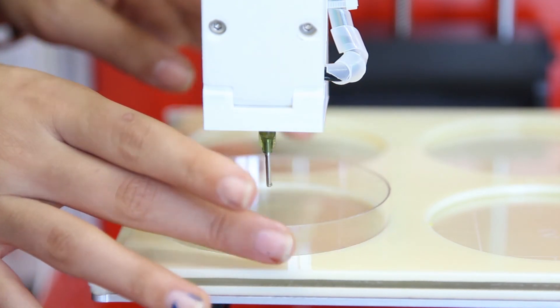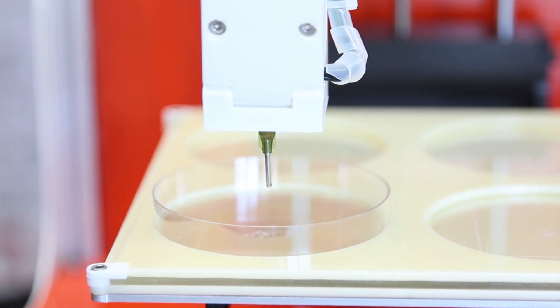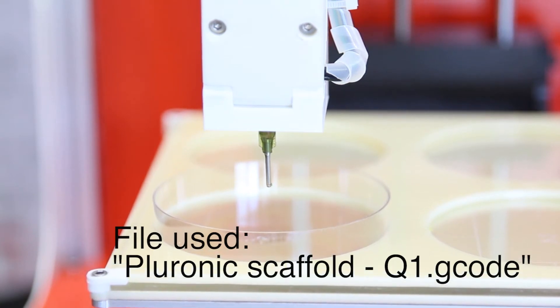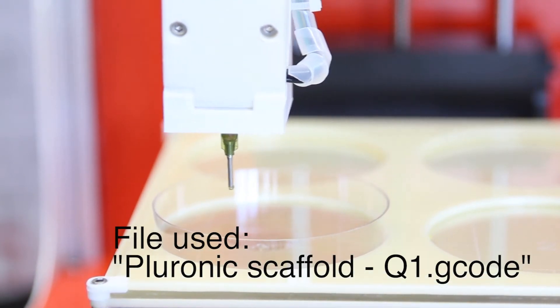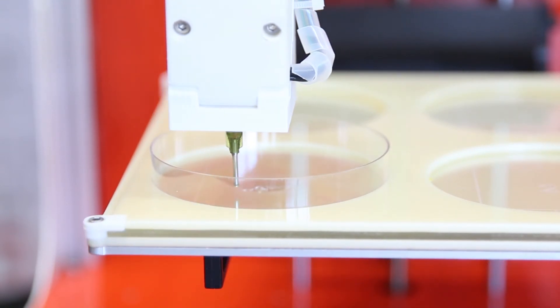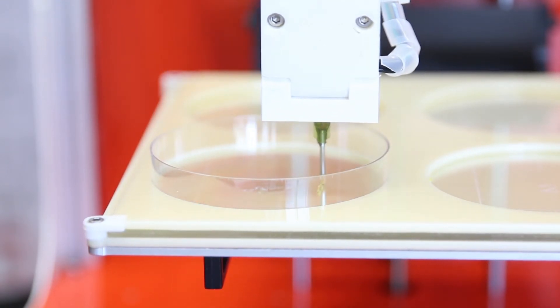Once you have primed and set the Z0, you can load a petri dish, load your file, and print. In this video we are printing a basic Pluronic scaffold in quadrant 1 of the bed.